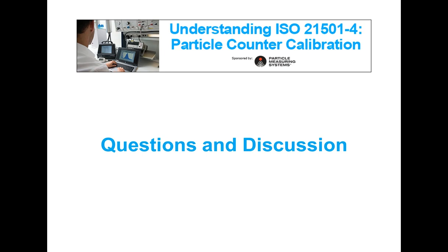Okay, and this question is, can we make adjustments in calibration on the particle counter, or is this locked out by the manufacturer and only the manufacturer can make those adjustments? So normally this is locked by the manufacturer also to avoid the instrument being adjusted by non-expert engineers and people that don't know exactly how to do a calibration.